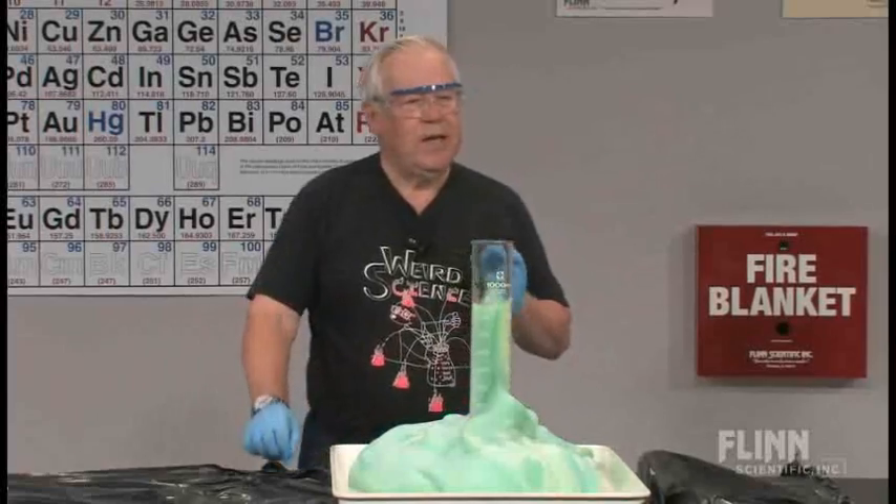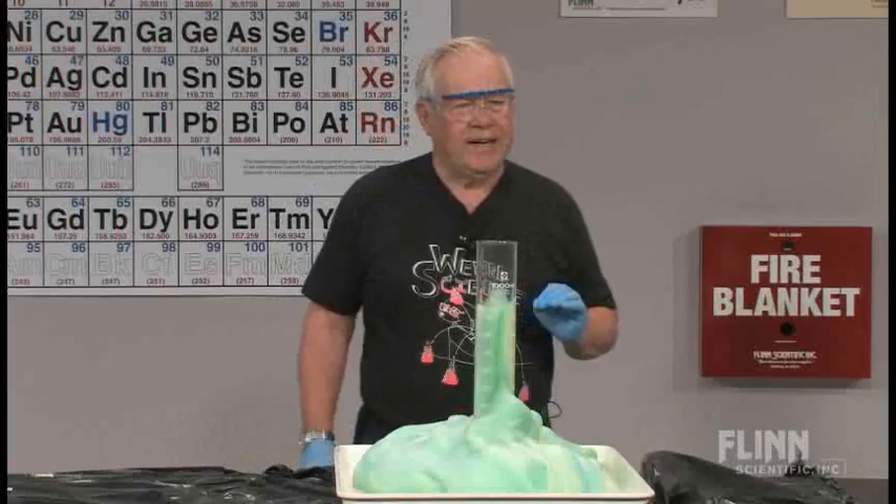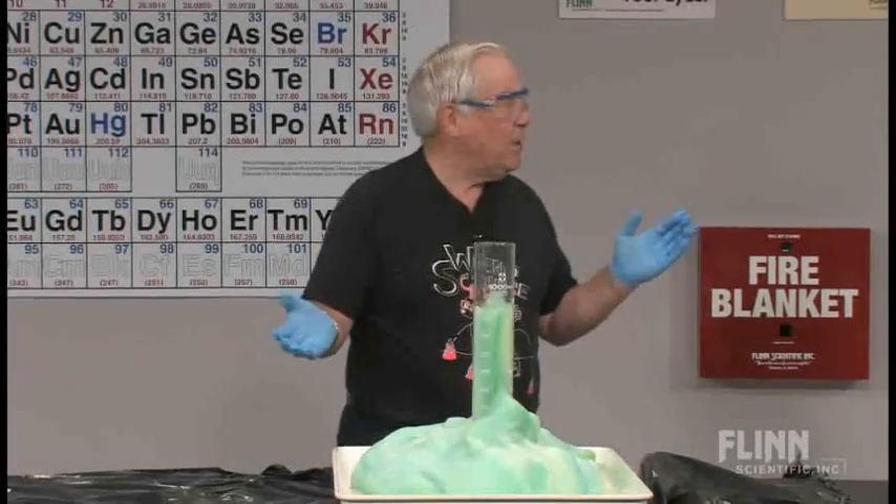You can do it in AP chemistry by having the AP kids try to figure out the mechanism for this reaction. It's got a catalyst, so the catalyst must be regenerated.